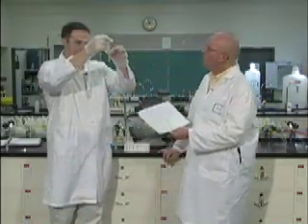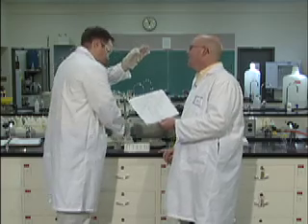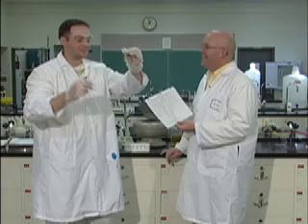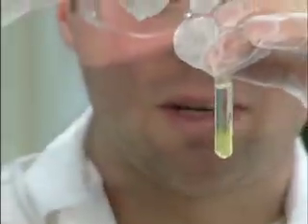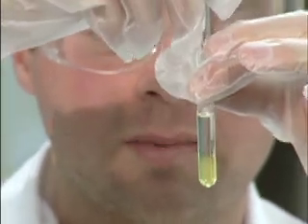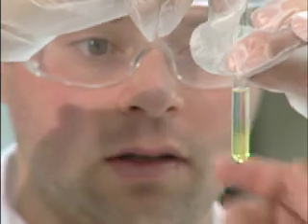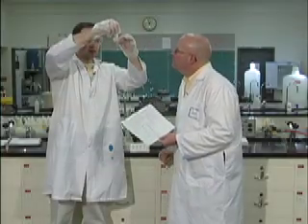It kind of separates out a little bit. It's a flocculent precipitate. Oh, I can see that. So in order to get rid of my flocculence, I'm going to take a pasteur pipette and just stir. You'll notice something happen here. It gets really, really warm. Oh, it is warm. And what happens is you'll notice that the solid comes out into solution.